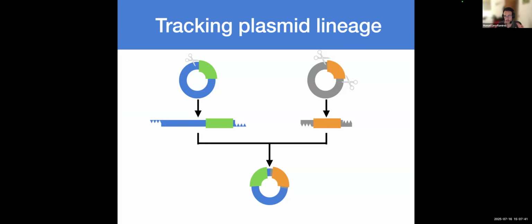If you are in this seminar, probably you don't really need to be taught about this, but just in case, when we talk about provenance of sequences or the lineage of a plasmid, we're thinking of what were the steps, the manipulations that we followed to go from existing sequences to the particular sequence we have right now. There's different ways of doing this. One of them would be using restriction and ligation, like I'm showing in this example, where you would use restriction enzymes to cut bits of a sequence and then ligate them to form a new one.